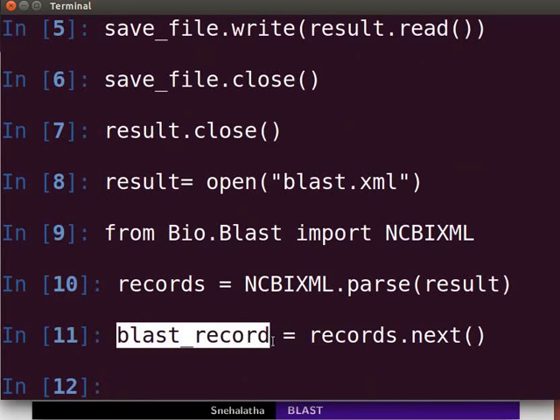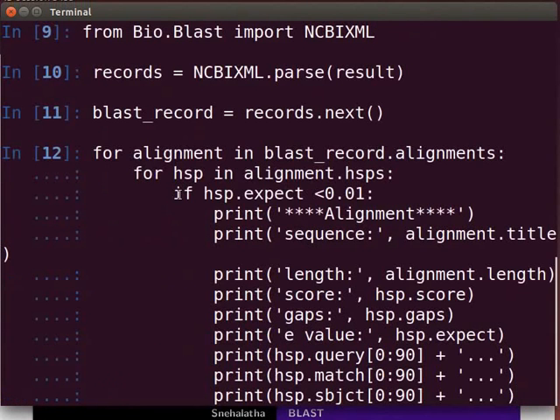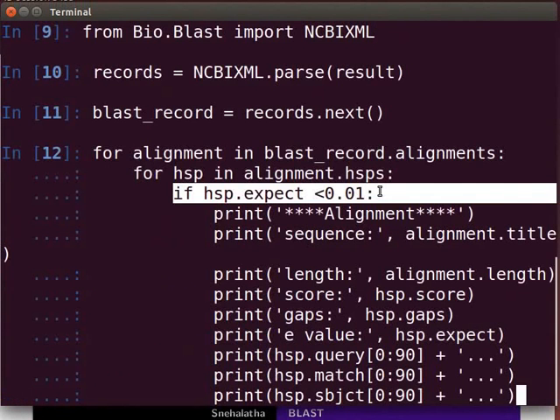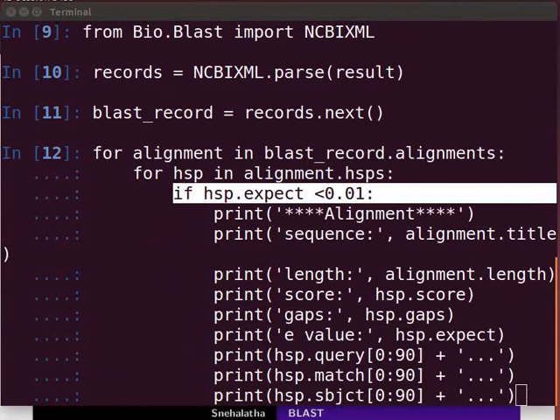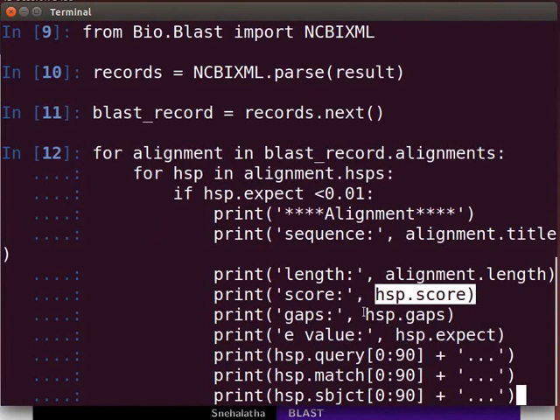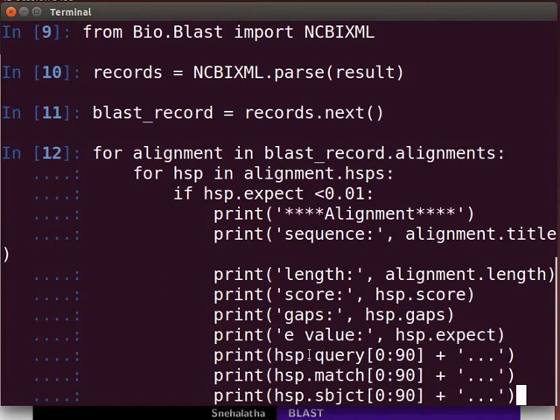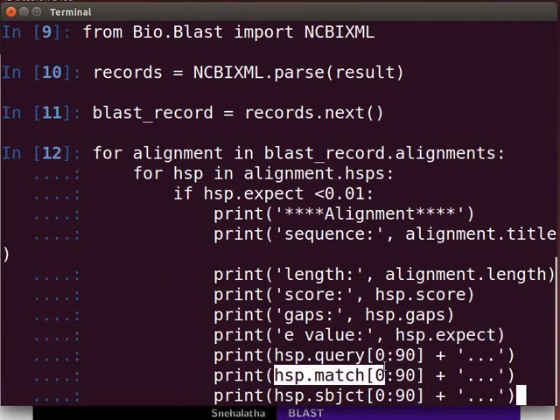Let us print out some information about all the hits in our BLAST report greater than a particular threshold. Type the following code. For a match to be significant, the expect score should be less than 0.01. For each HSP (high scoring pair), we get the title, length, HSP score, gaps, and expect value. We will also print strings containing the query, the aligned database sequence, and a string specifying the match and mismatch positions.